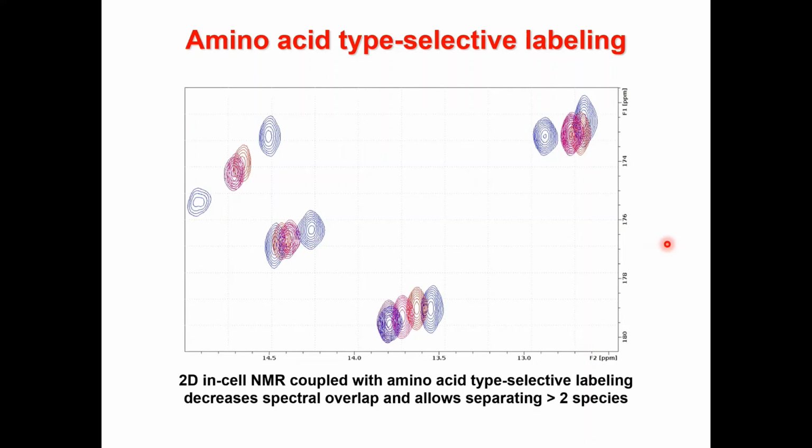And in fact it is, because by selectively labeling the histidines coordinating the zinc, we can increase the dimensions along which we have chemical shift perturbation. So you see the perturbation in 2D instead of 1D. You have no more signal overlap.